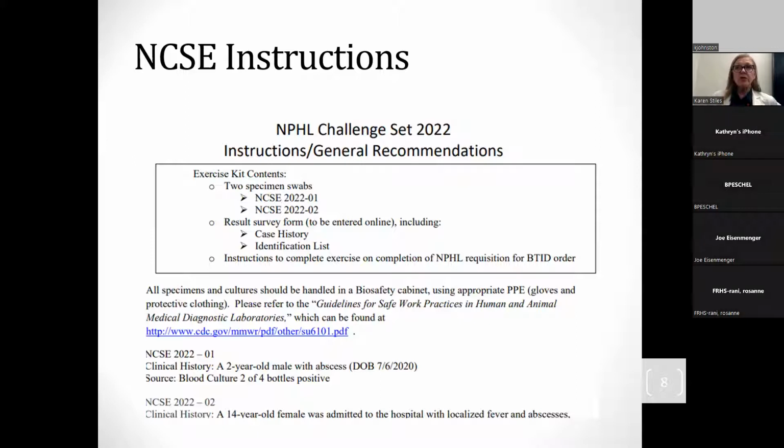And I thought I would share today too, that Sean Kaufman, who's a big biosafety guru in the real world of laboratory, has some training out on just the biosafety cabinet. And I think he really comes about it a different way. He makes you think about it. He actually has designed the class as a competency. So if you are a manager of a small laboratory, you have a couple of people that need to go through this kind of training, which I highly recommend that you do.